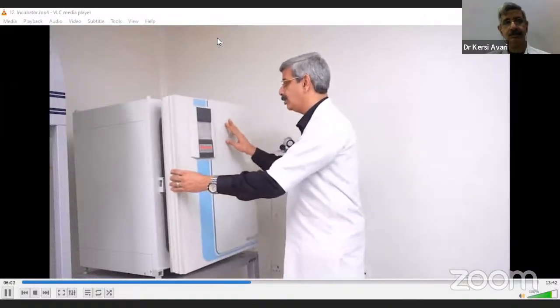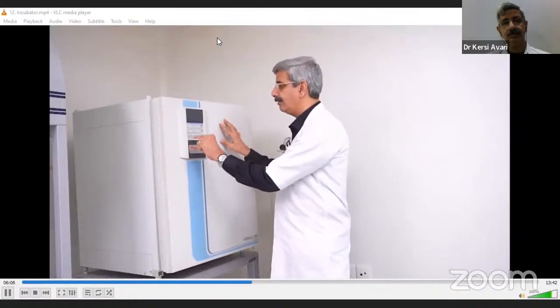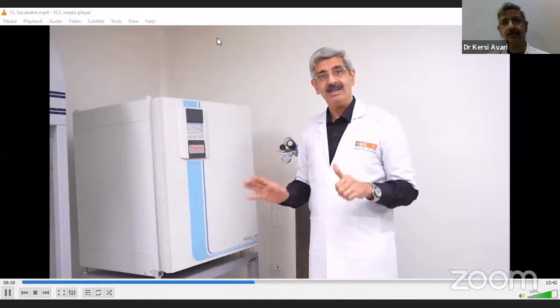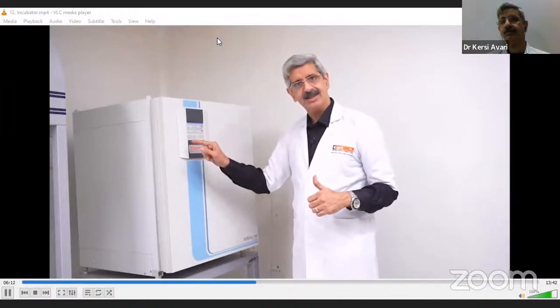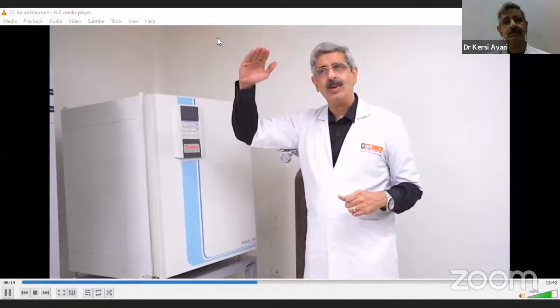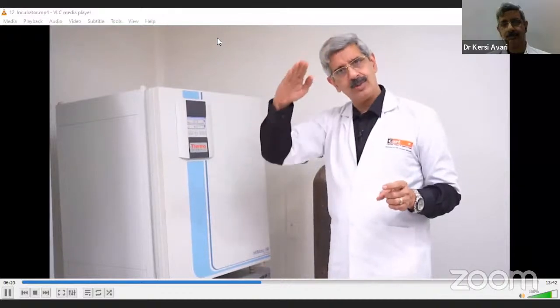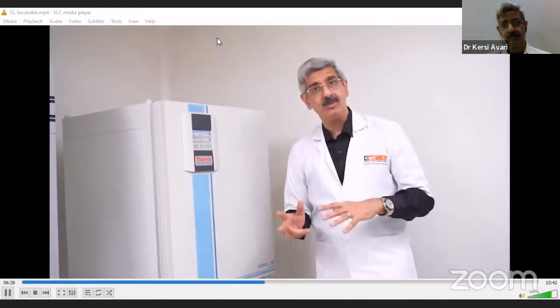That you have what we call contracon facility or auto sterilization. Means you press this, the temperature shoots up to 110, 120, maintains it there for 20 minutes or so, and then gradually cools down. So it is like the incubator taking care of itself. Now this facility could not have been possible in a water jacketed.